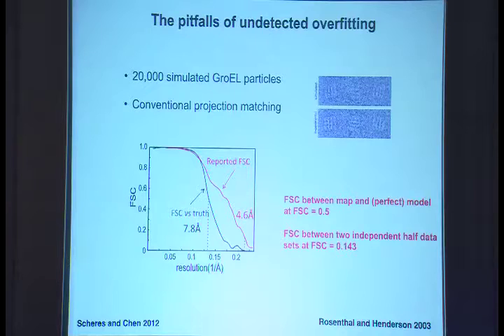This is important because, in principle, you can claim resolution anywhere. This is happening recently in many papers, where people tend to use, instead of one of these values, 0.25, 0.3, or sometimes 0.1 and so on, which is, again, mathematically not meaningful.